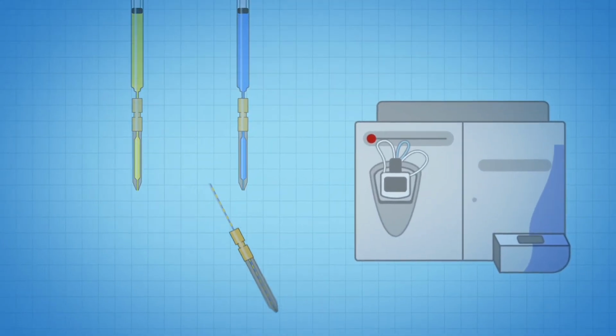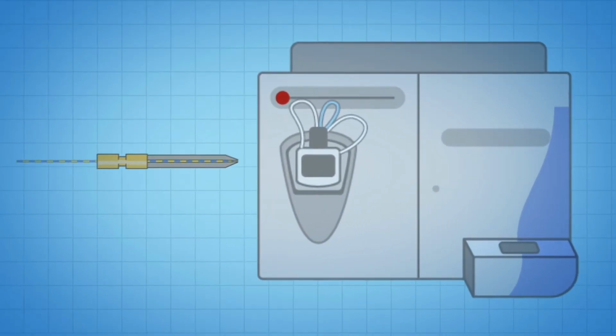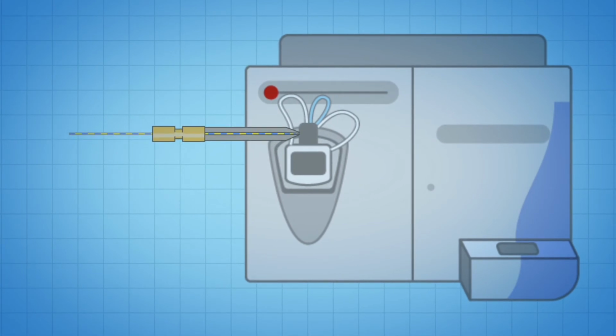When filled, the collector tube is reoriented horizontally with its distal end oriented toward the mass spectrometry injection port. A high voltage is impressed between the mass spectrometry injection port and the solvent in the collector tube. Femtoliter droplets are ejected from the collector tube into the injection port for detection until all samples are injected into the mass spectrometer where they are detected and characterized.